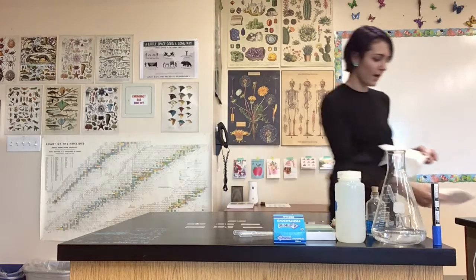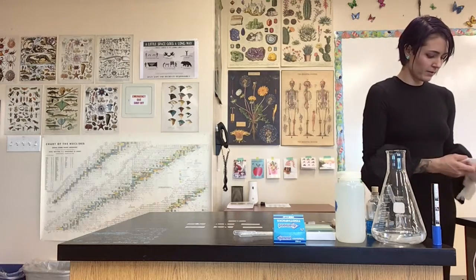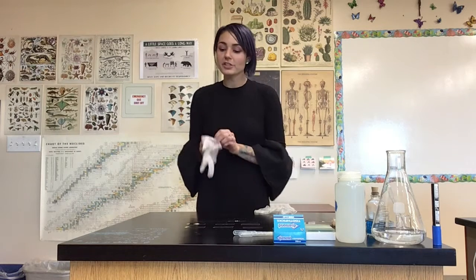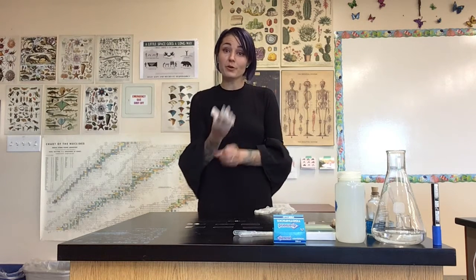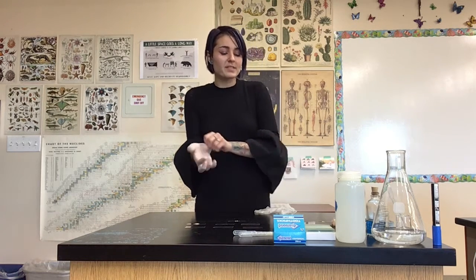I have my paper towels and I have my gloves. So now what I'm going to do is start staining my cheek cells because that's going to take about 3 minutes for them to fully absorb the stain. And what I'm using to stain my cheek cells is a substance that's known as methylene blue.